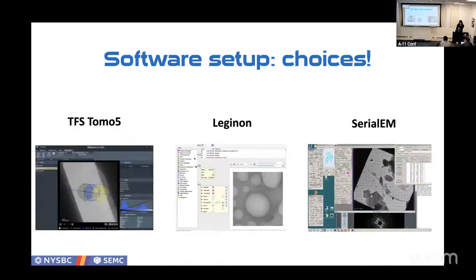So let's go to software. There are many choices available to you. And recently, I don't know the state of the development of Leginon. We use Leginon a lot for single particle, and we love it. It's great. It has a database. Everything's connected, convenient, and easy to understand. But tomography development, I think, pretty much stopped on it.